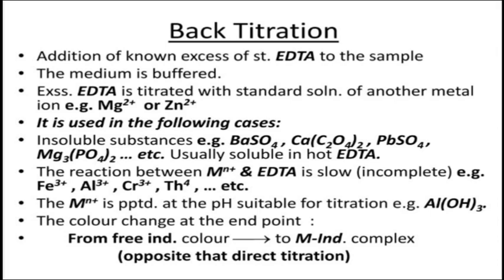Back titration: addition of a known excess of EDTA to the sample. The medium is buffered, and the excess EDTA is titrated with a standard solution of another metal ion, for example magnesium or zinc.